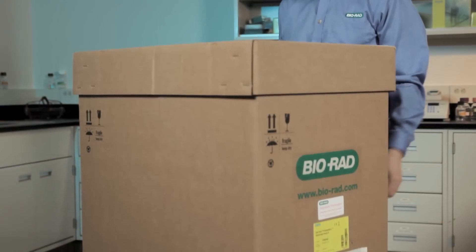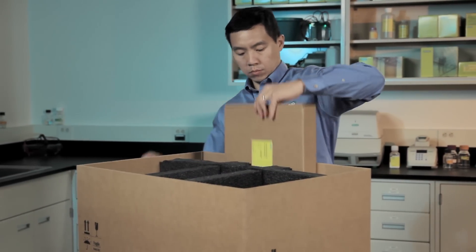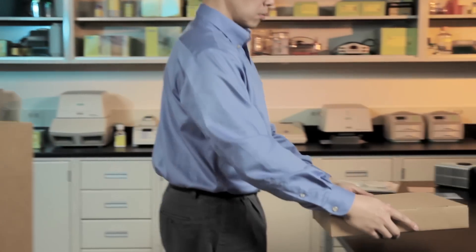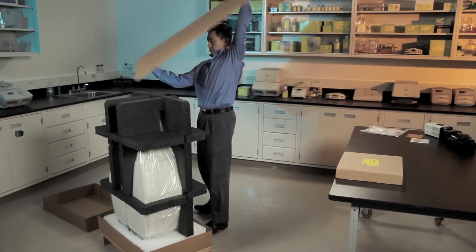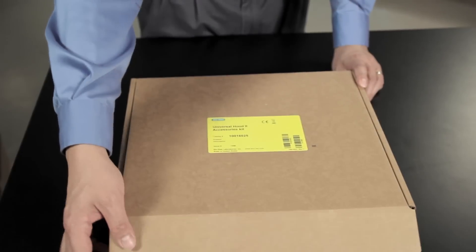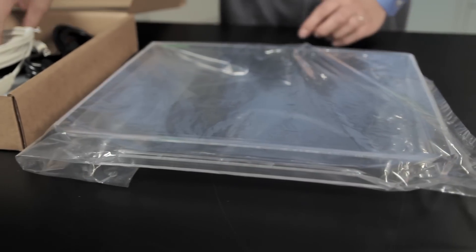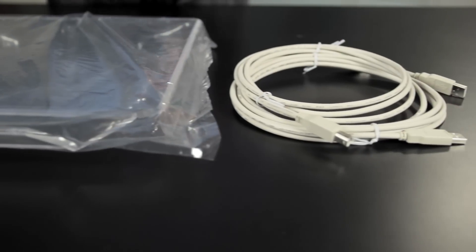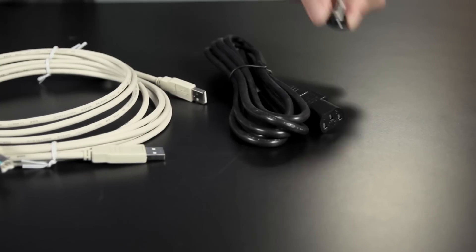Next, cut the plastic straps on the large box and remove the top and the small box containing the hood accessories. Then remove the sides of the large box to access the hood. From the small box, unpack the UV shield, two USB cables, power cord, and camera screw.